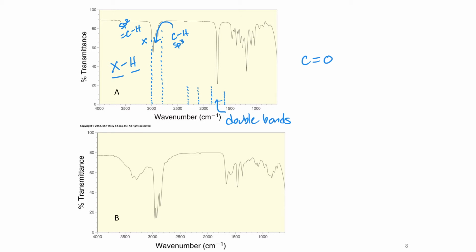And we can tell if there are alkenes present, or at least we can see if certain alkenes are present. There are no alkenes present in this spectrum. Indeed, the only interesting peak is this peak at about 1750. So we know that our molecule has a carbonyl of some sort in it. That's all we're going to do with this spectrum. We've identified that there is a carbonyl.